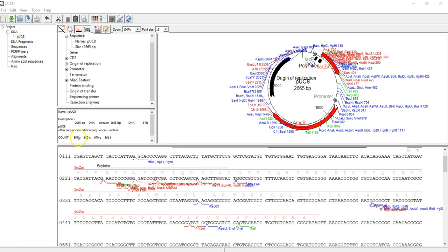Today I'm going to show you how to perform restriction enzyme analysis on your plasmid sequence. First, let's open the pUC8 plasmid molecule.